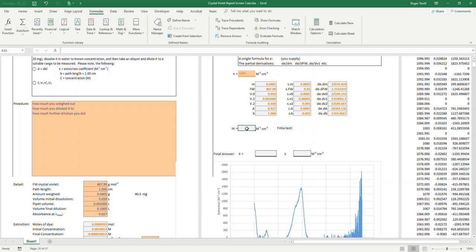And accordingly here now, S sub E is going to equal, I'm going to type it up. Maybe I'll try typing it down here. Maybe that'll be a little easier to see.